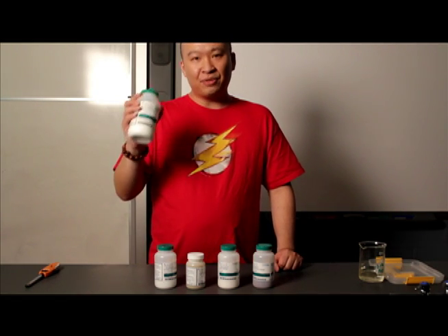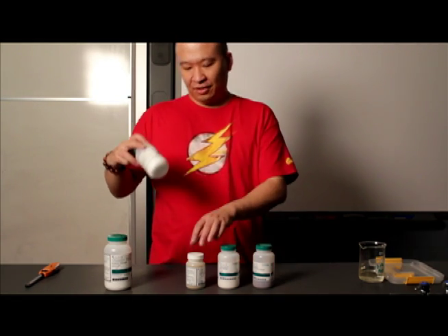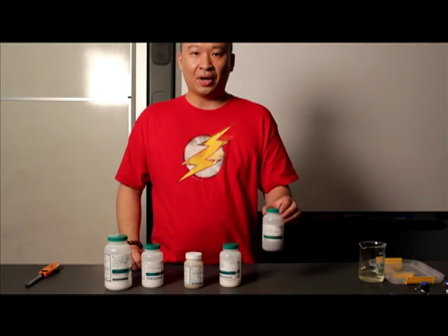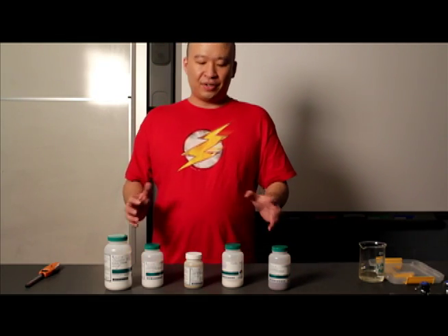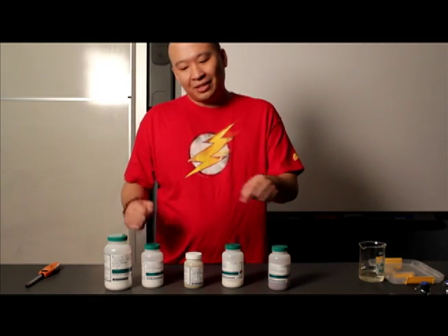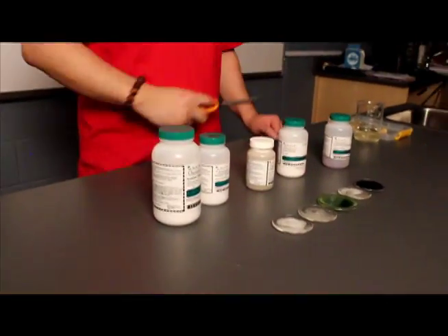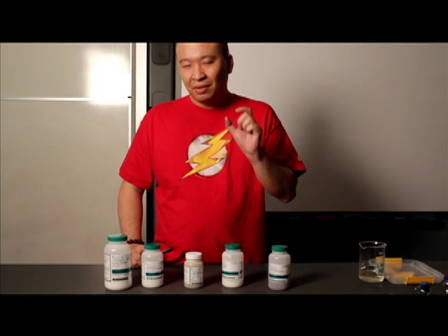Right here in front of me I have sodium chloride, strontium chloride, copper chloride, lithium chloride, and cobalt chloride. All of these substances have different colors as solids, but if you add a little bit of alcohol in there and get my trusty little flame, if I light them up, you should actually see some pretty cool colors and some pretty cool flames. So let's get those lights turned off.